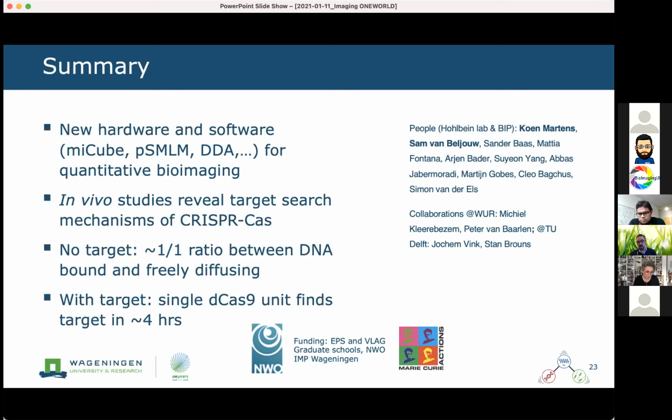But for example, for live cell imaging, I would be very interested in seeing whether other people in that field could reproduce the data. But also just for beads, let's talk about microscopy and just the beads, right? There are so many different ways of measuring beads, or how people measure the smallest dot in your field of view and take the full width at half maximum of it. I think we don't actually have any standards for how we can measure beads, right?